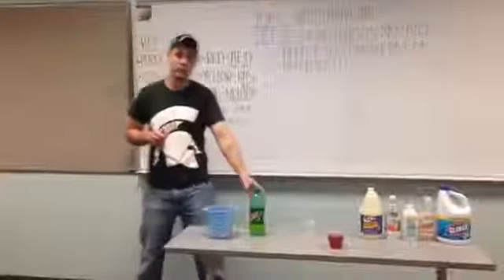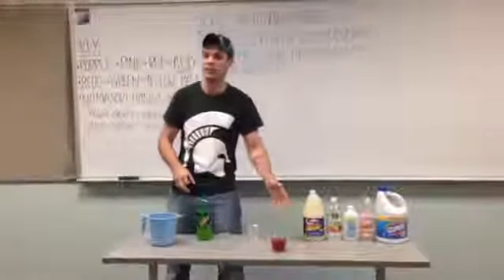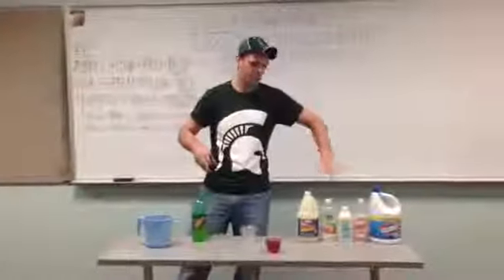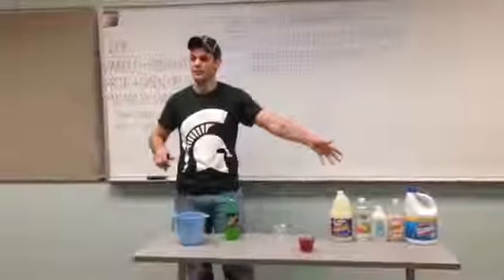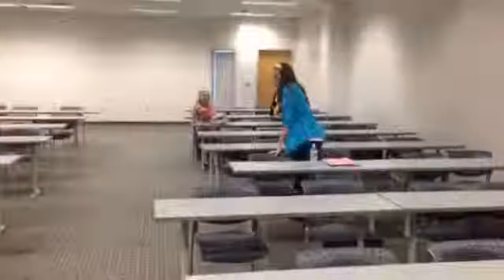And now that we know Mountain Dew is an acid, and it turned the water to a reddish color, is there anybody that thinks that they know which one of these or how many of these is a base? Yes, you. Bleach is a base. Well, why don't you come on up here, write your question down, and you can test that out. Write your question on the board. And can you repeat your question for the class so they know what we're doing?